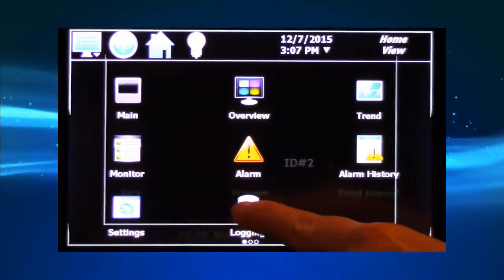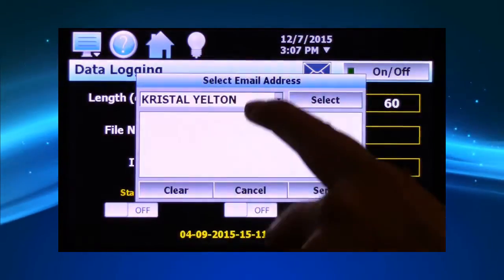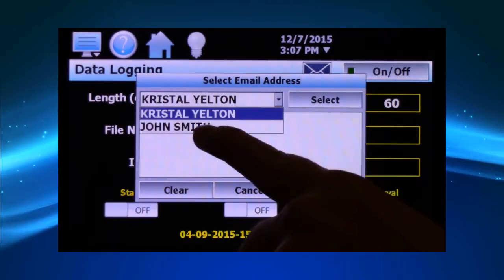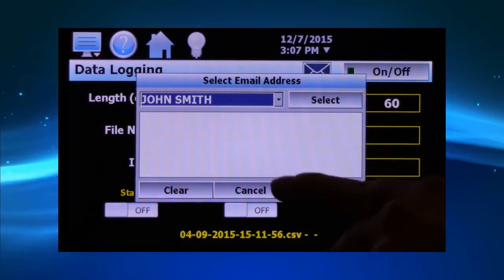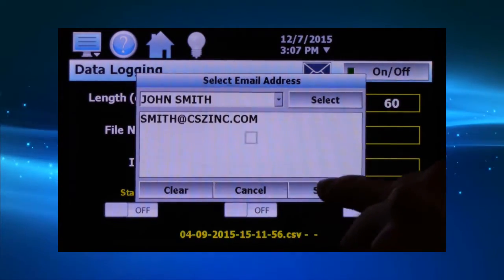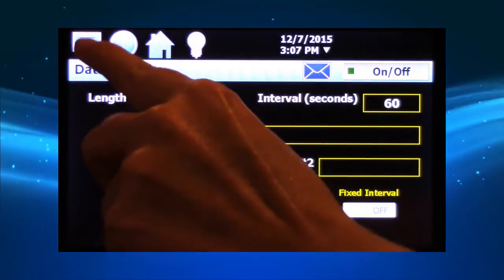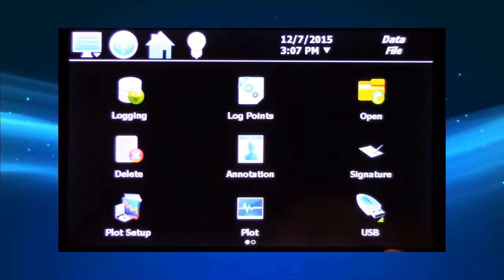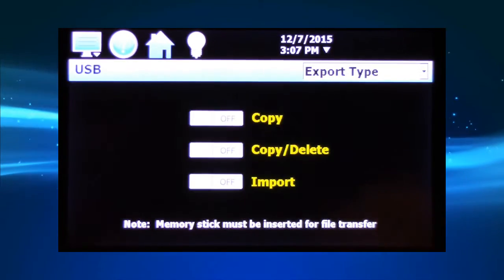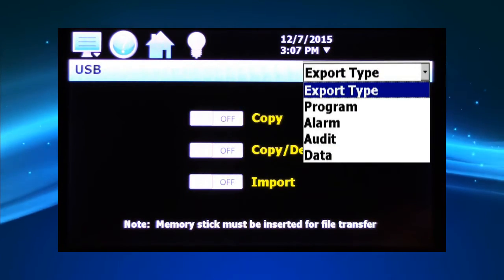The controller features data logging with custom file names, log interval, and data file length. Email data log files or utilize a USB to download files or upload existing profiles.